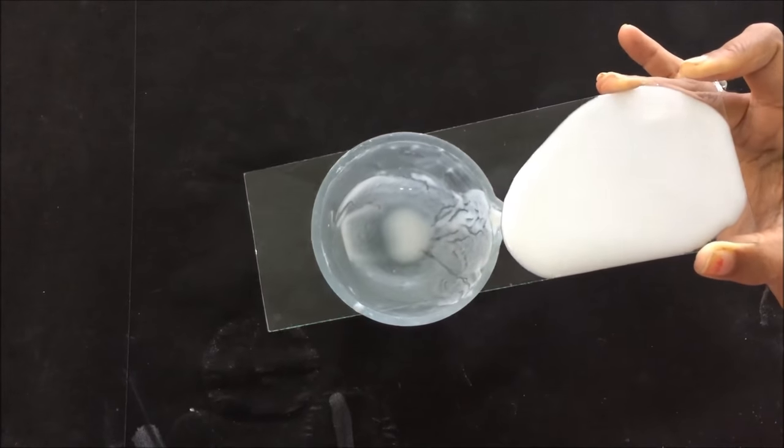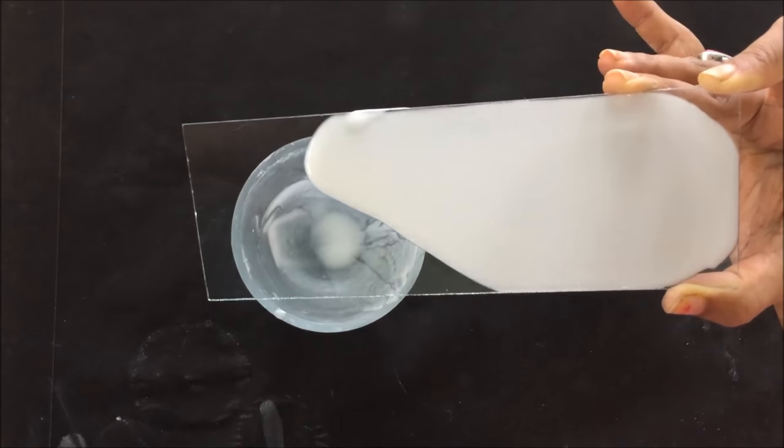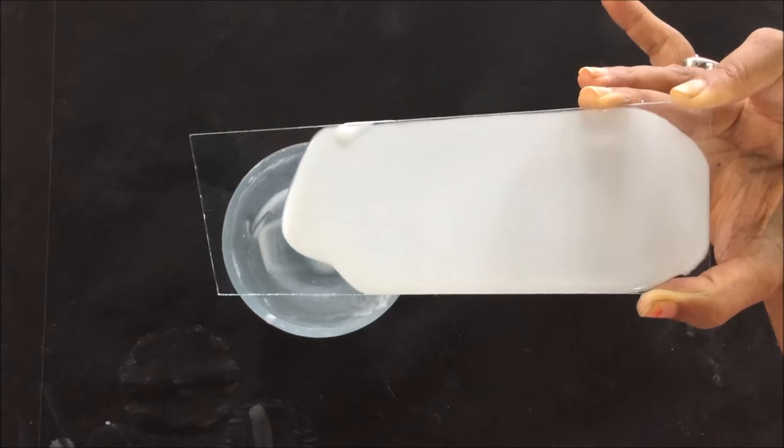These TLC plates can be used for analytical study. It is used to identify the components of a mixture and also to check the purity of the sample.